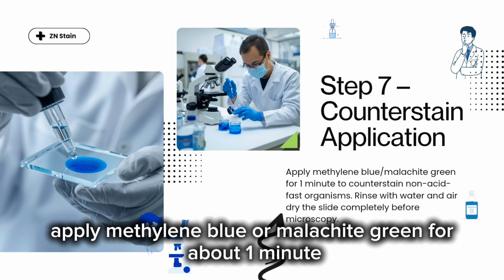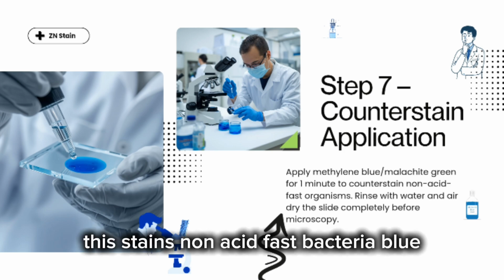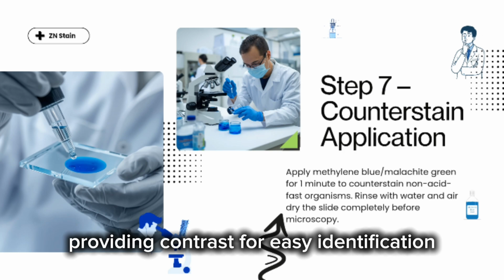Apply methylene blue or malachite green for about 1 minute, then rinse and allow the slide to air dry. This stains non-acid-fast bacteria blue, providing contrast for easy identification.